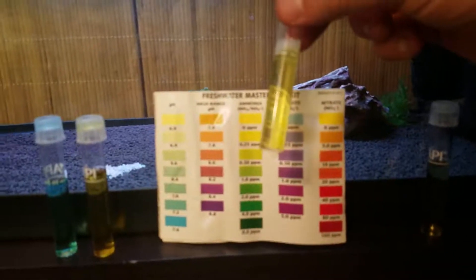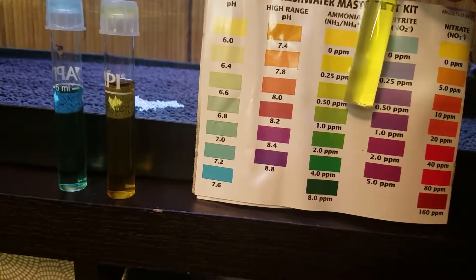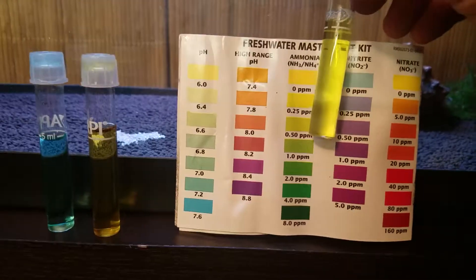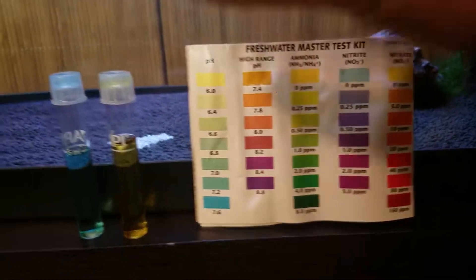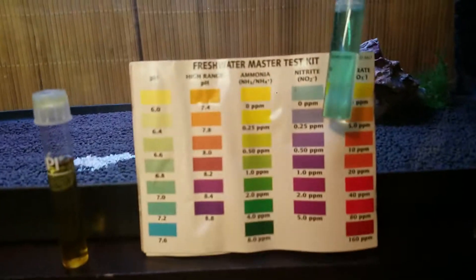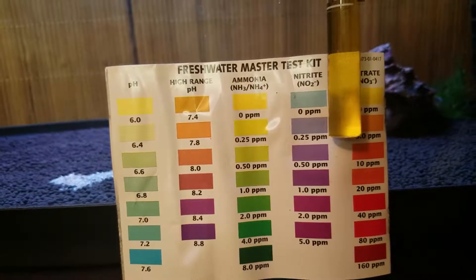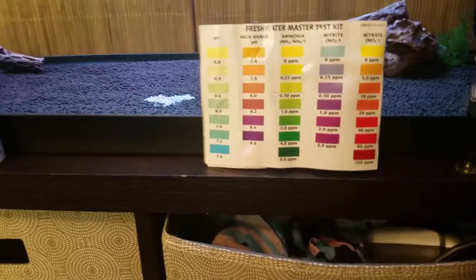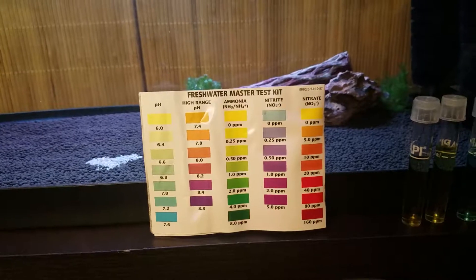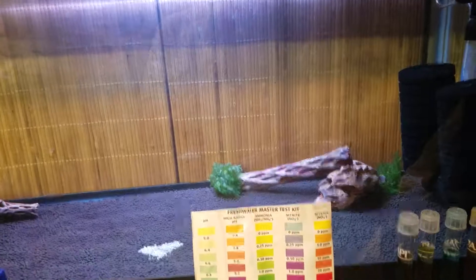Next up is ammonia. The ammonia here is a little green and it's pretty close to 0.5. It actually means the soil and the seamo is beginning to do its job and adding the ammonia properly. My nitrite is still at zero, which hopefully means my nitrate is still at zero too. It's not cycled yet, but you keep testing once a week until the ammonia, the nitrite, and the nitrate are all at zero.